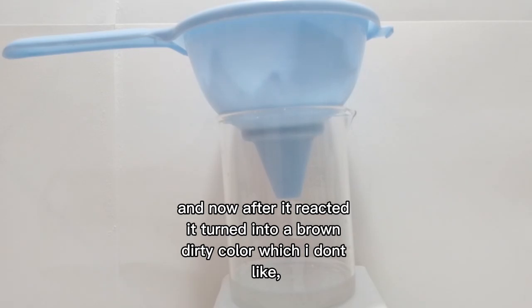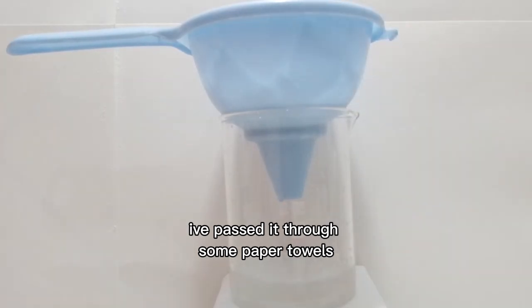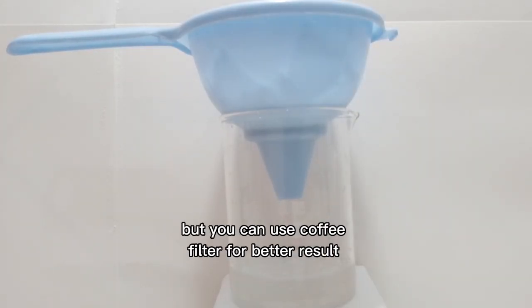After it reacted, it turned into a brown dirty color, so we will just filter it into a clear liquid. I passed it through some paper towels, but you can use a coffee filter for better results.